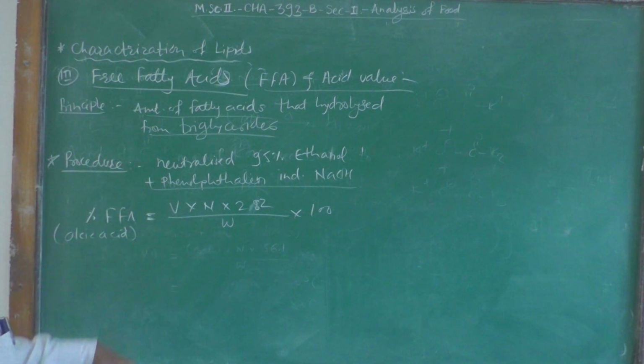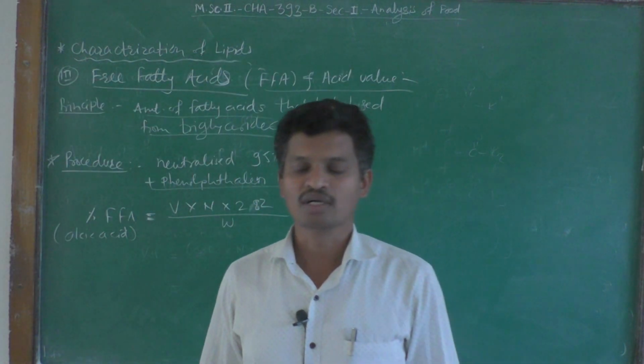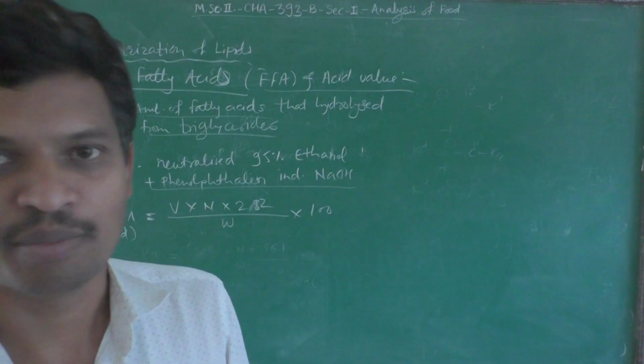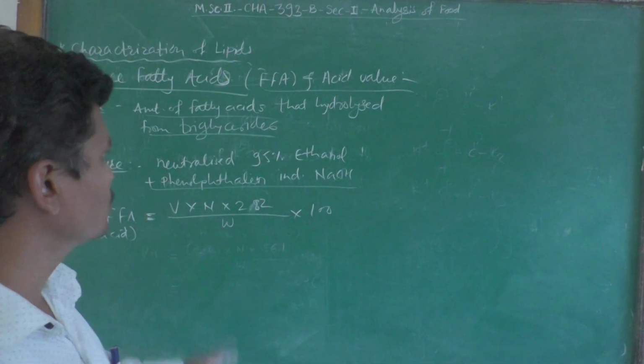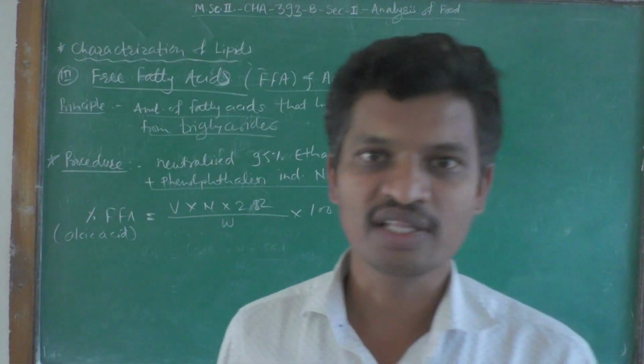In this way the free fatty acid content or the acid value can be determined. So these are the three characterizations. The remaining characterizations we will see in the next lecture.